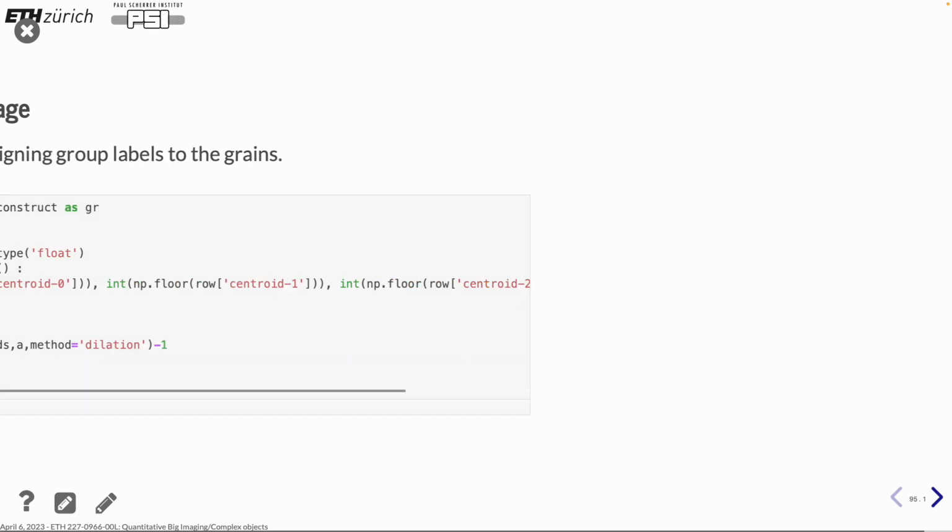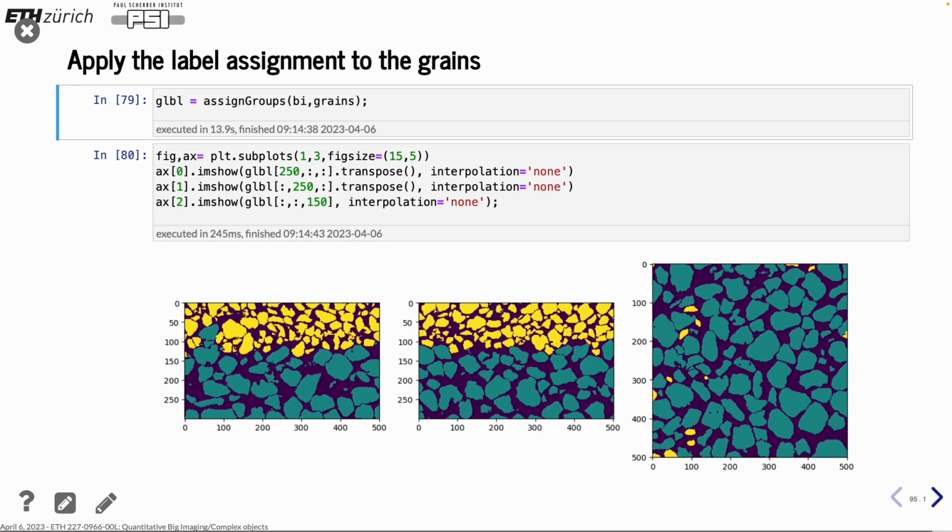Yep. And the result is now that when we have imposed the classes, we can see nicely that there is a good separation between the two classes. This one is probably in the range of uncertainty, so small was classified as large, so that can happen. So this is in the error bounds of the method.